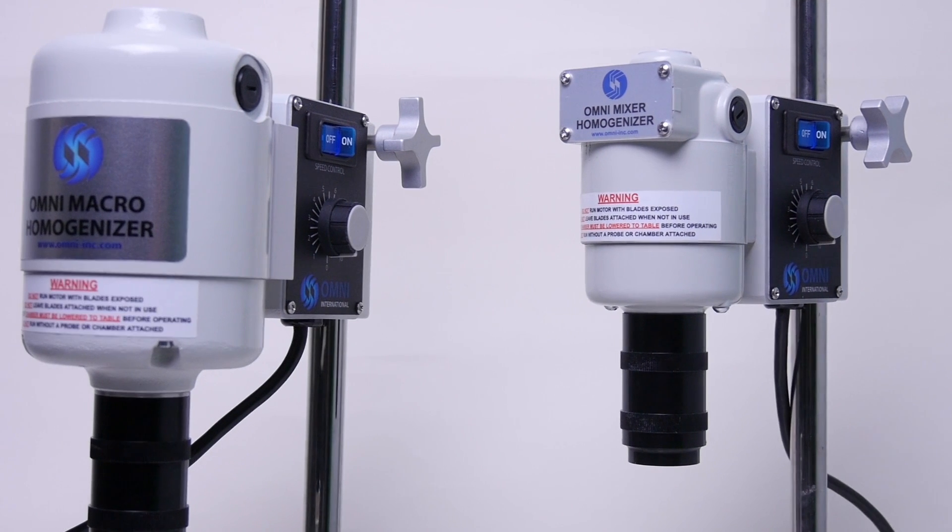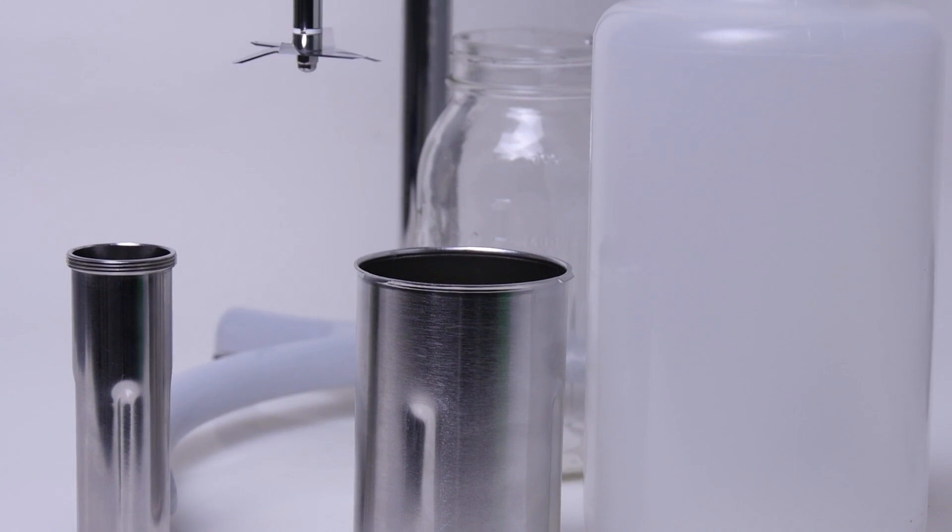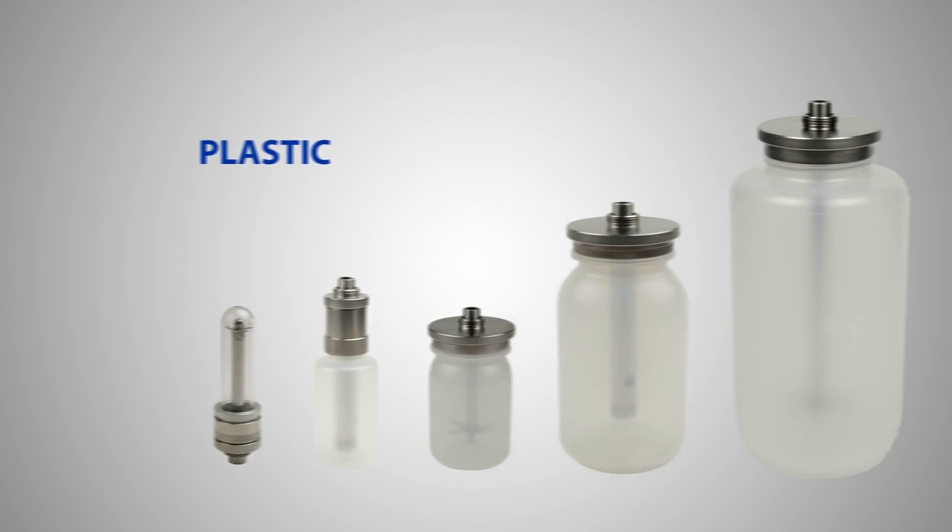With unrivaled versatility, the Mixer and Macro are compatible with the widest array of accessories, including an array of interchangeable cutting blade assemblies in sealed plastic, stainless steel, or glass jars.